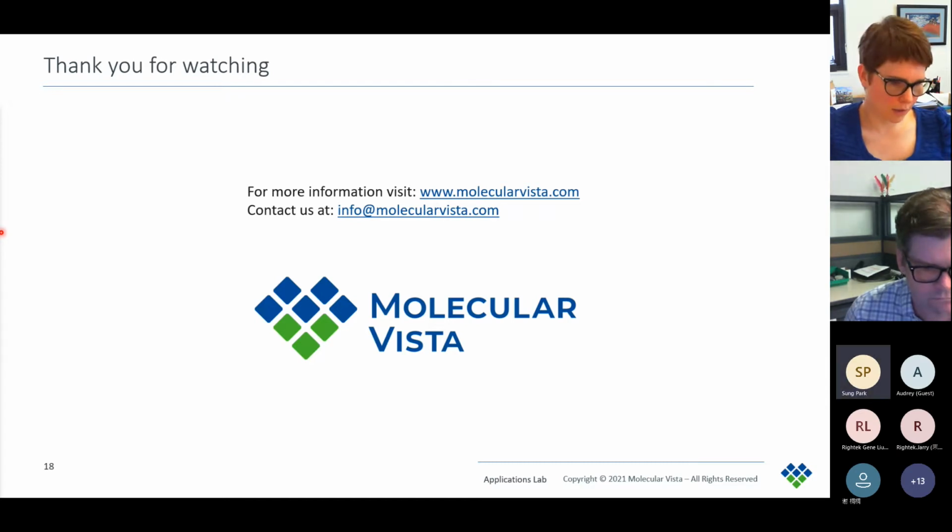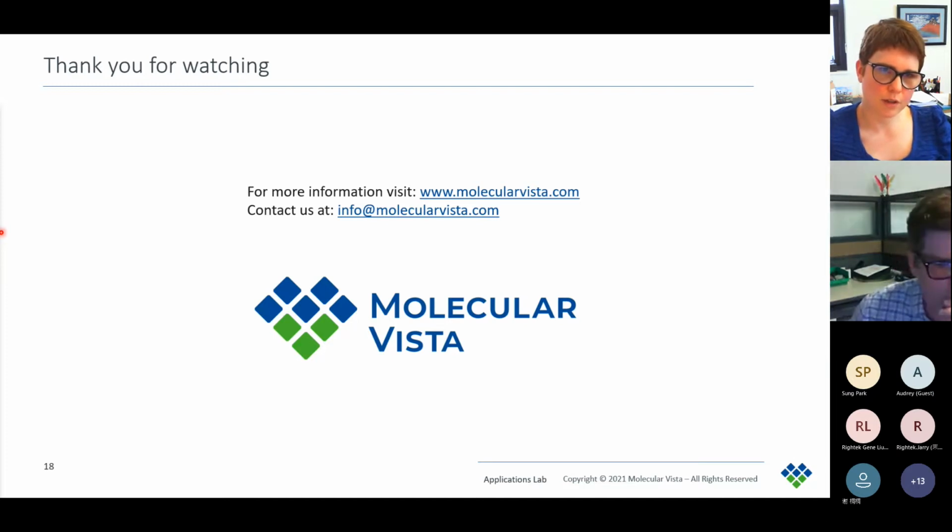Yeah, that's a good point. We are able to cool our plates during polishing, and that hopefully helps. But I've never used a microtome. I guess because the whole blade goes through the sample, it would drag some organic of the resin along. So that's a good point.